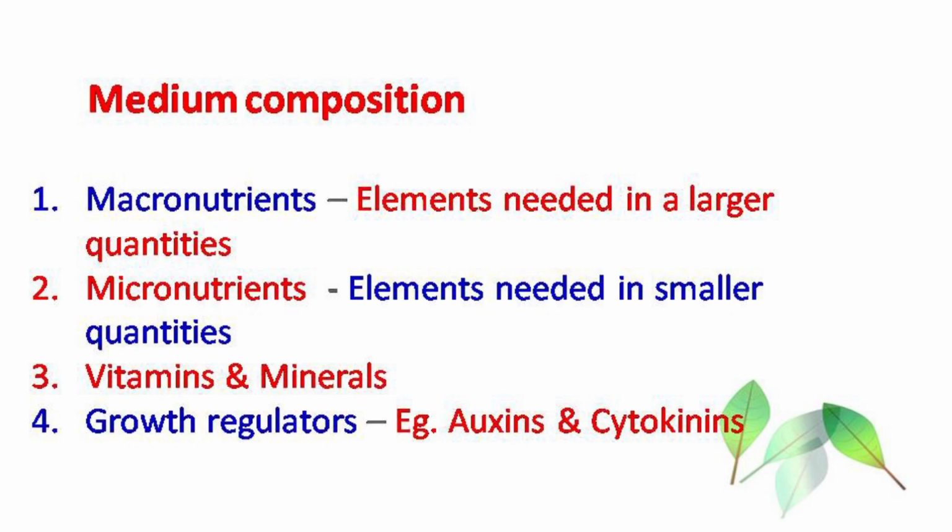The composition of the medium. The medium contains macronutrients, micronutrients, minerals, vitamins and growth regulators. Macronutrients means the elements required in large amounts. Micronutrients means the amount of the elements required is very small.